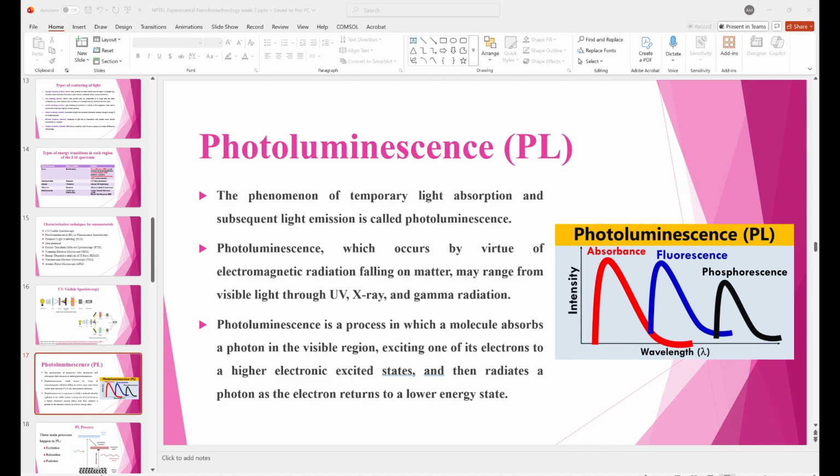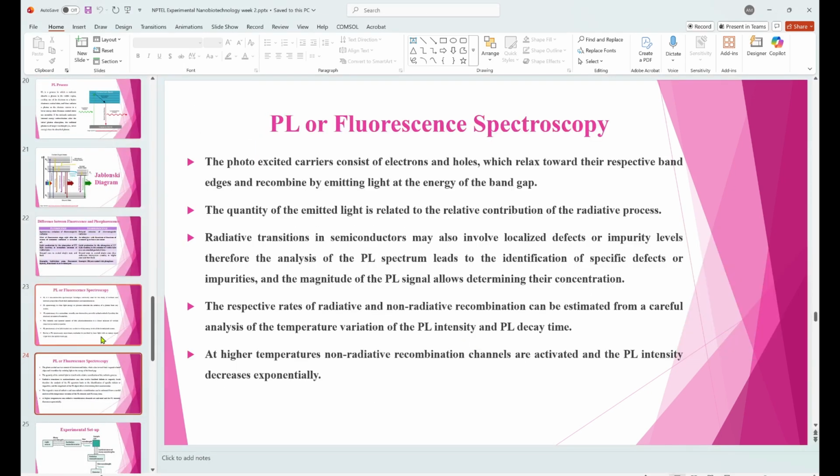What kind of cuvette do you use in UV-visible, and what kind of cuvette do you use in fluorescence spectroscopy?